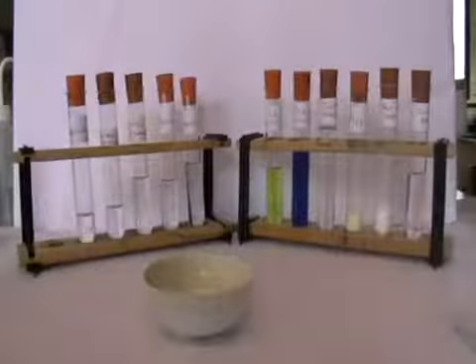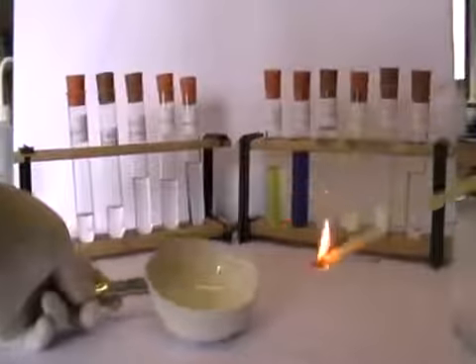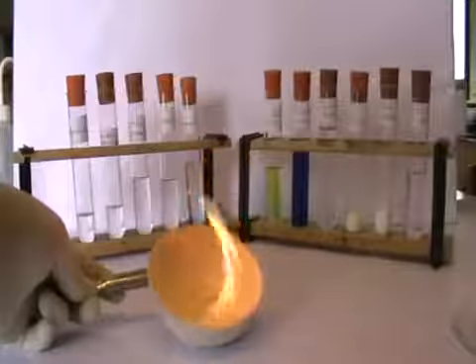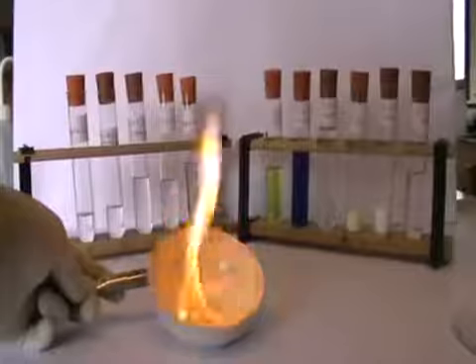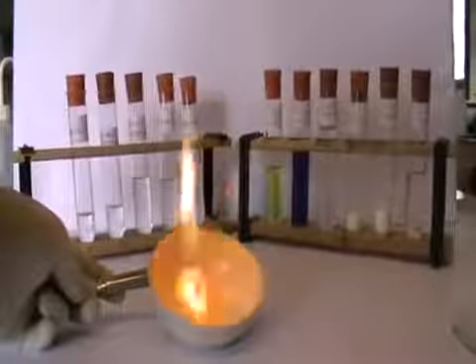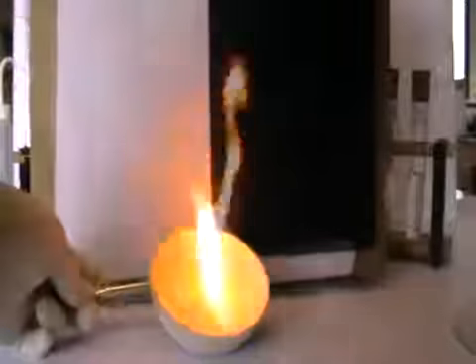Keeping my ignition source well away. So let's see if this will ignite. And right away it catches fire, burning rather like the ethanol we saw earlier, burning with a yellow flame or yellow-orange flame. And that flame, I think you can see, is quite a clean flame in fact.